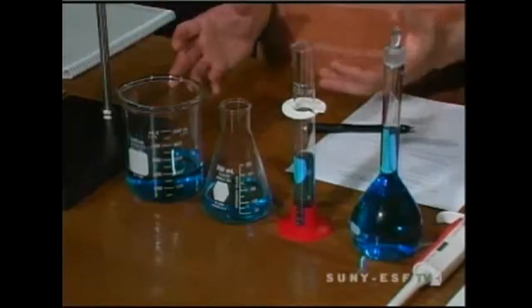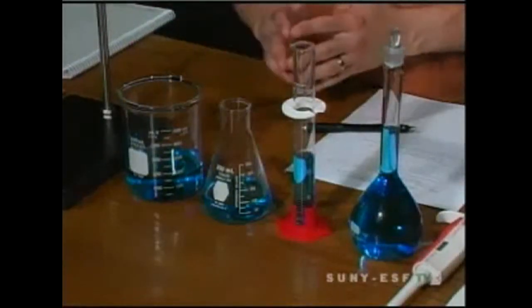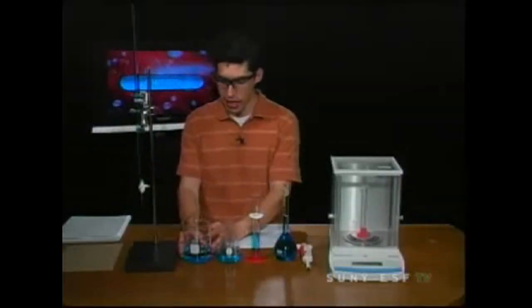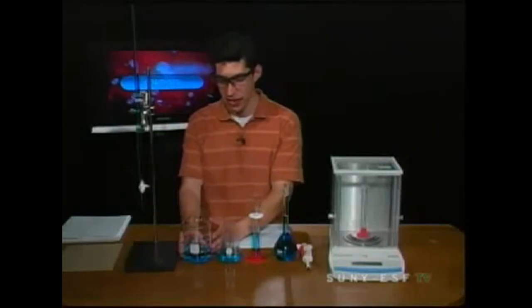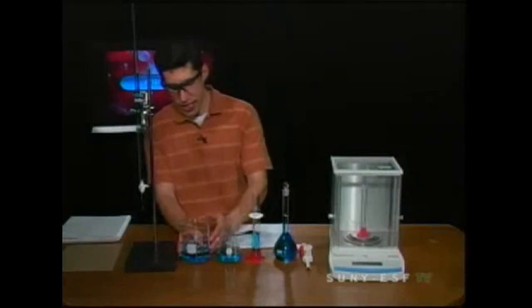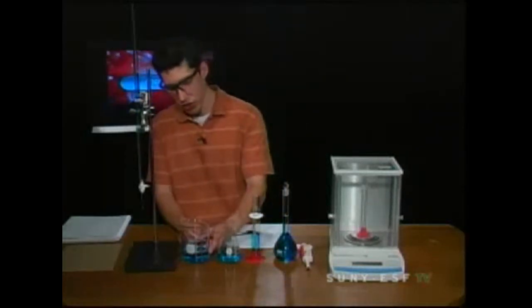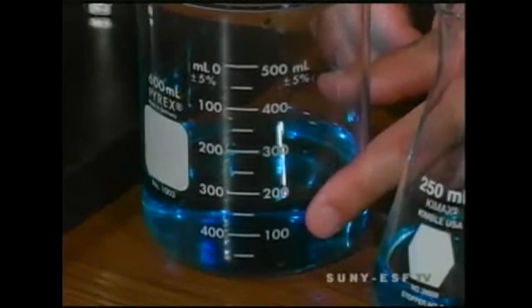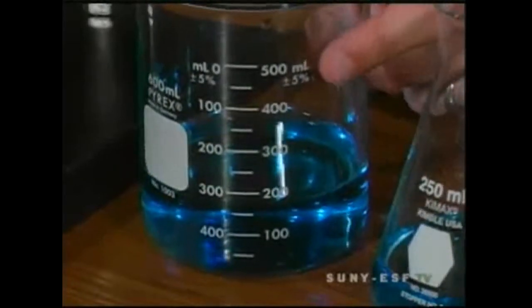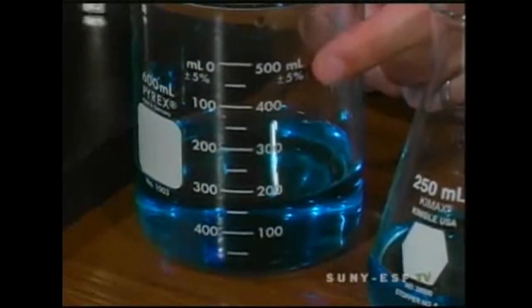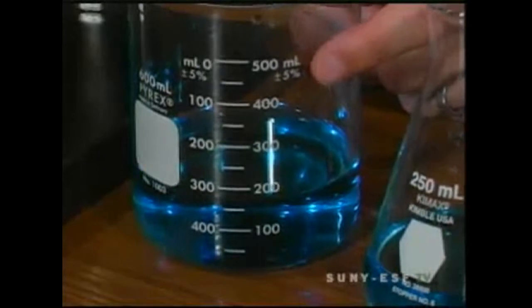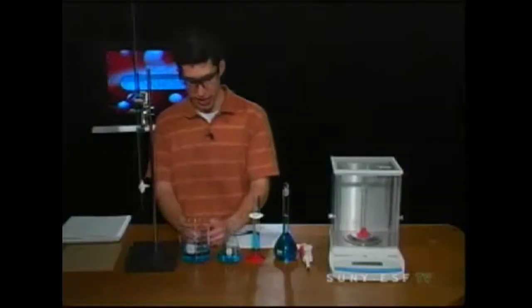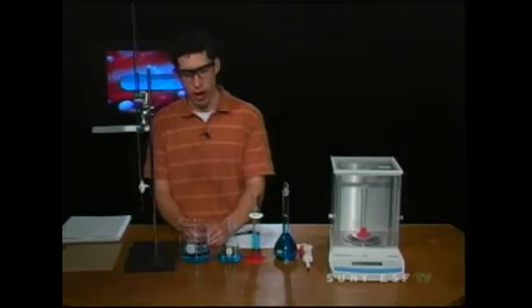So the first thing I've done is obtain some blue liquid - it's just food coloring and water. What we're going to look at is the beaker. The beaker is probably one of the most common instruments that you see in the lab. I filled this up to a point that looks like it's around 150 milliliters. And I say around, and that is signified by the fact that right here it says plus or minus 5%. Everything is in milliliters because in science and in the lab, we use the metric system. But it's good for approximate volumes.